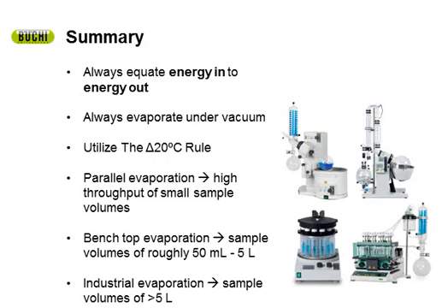Okay, next one. Do you have any performance data of your Rotavapor, lab and industrial scales, to separate butanol, acetone, and ethanol from fermentation media? Is it possible to sequentially separate butanol from acetone and from ethanol from a mixture of fermentation medium? I've heard of this application before, and yes, this is something that you can do, and I do have actual performance data on these solvents. I don't have it on me now, but I'm going to get to the last slide, and you can email me the actual solvents, and I'll get you the actual distillation capacity and the throughput for it.